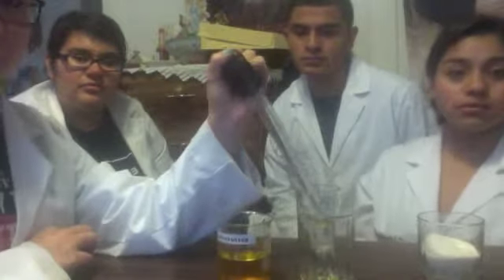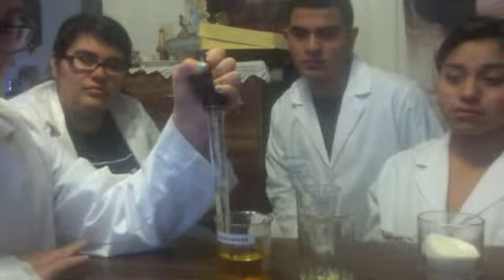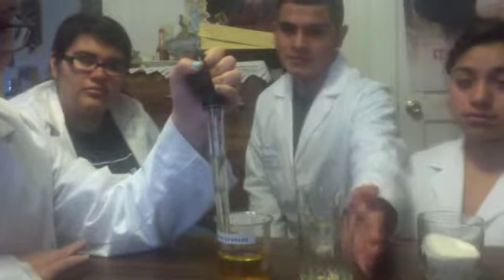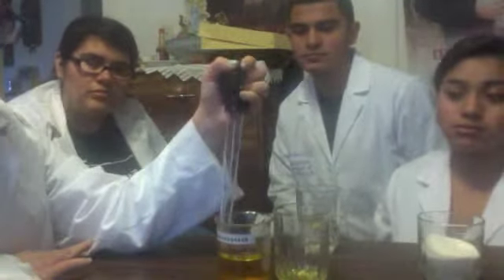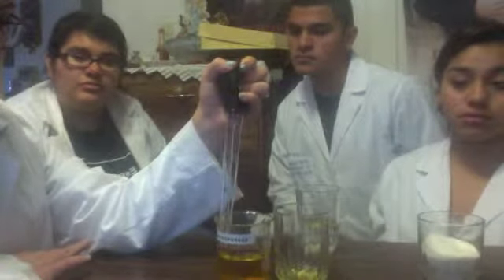To extract the ethyl acetate and the caffeine, we use a micro glass pipette. And we extract by sucking mostly all of the ethyl acetate layer into the micropipette and place it in a different beaker that is clean. And you try to get as much as possible without getting any of the tea beverage.